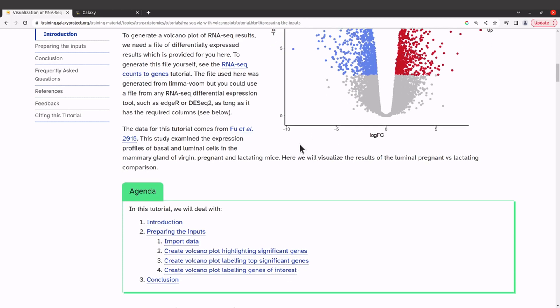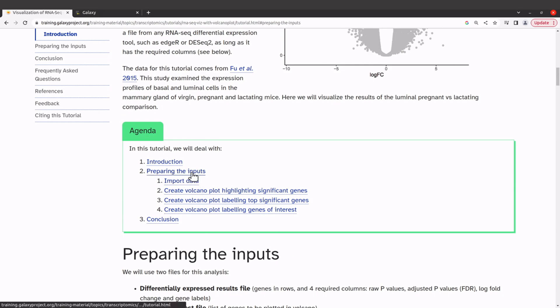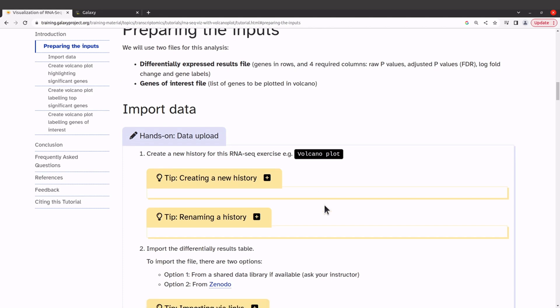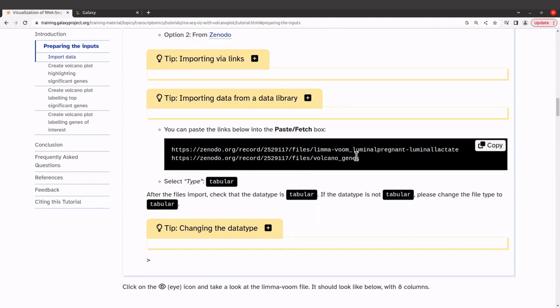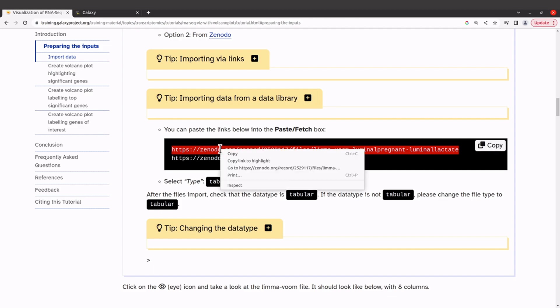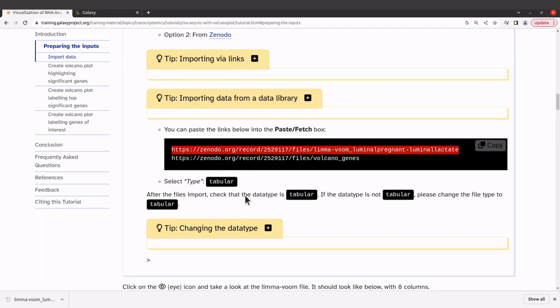Now let's get our example data. Scroll down to the 'Preparing the Inputs' section and you'll find the download links. We are going to download the example data onto our PC and then upload it — I'm doing this because some of you may have your own dataset to analyze, so I want to show the entire process. I'll highlight the link, right-click, and go to the link to download the first file.